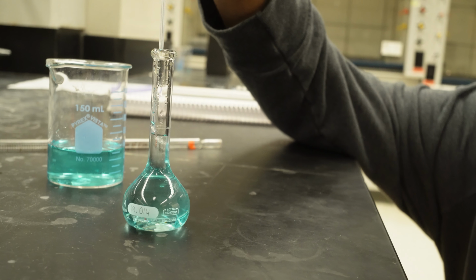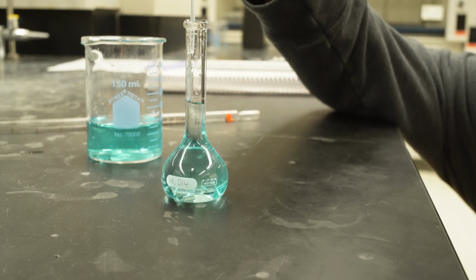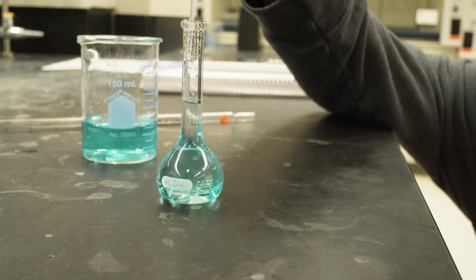We must first start with a stock solution. Here we can see Alex pipetting our stock solution into the 25 milliliter volumetric flask. She's going to pipette it until it reaches the 25 milliliter mark.